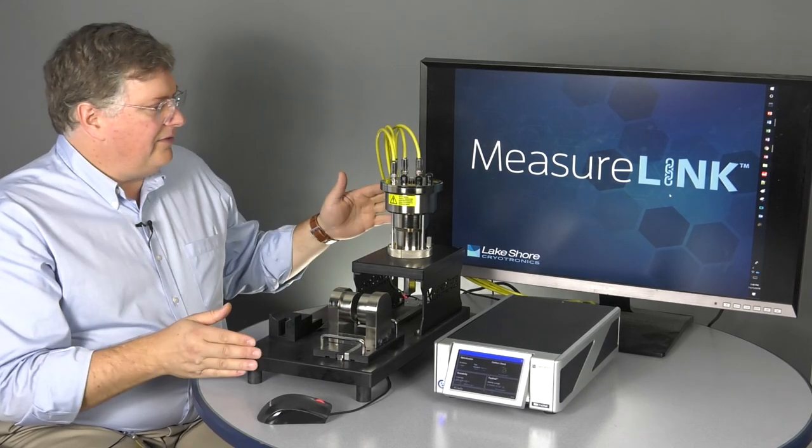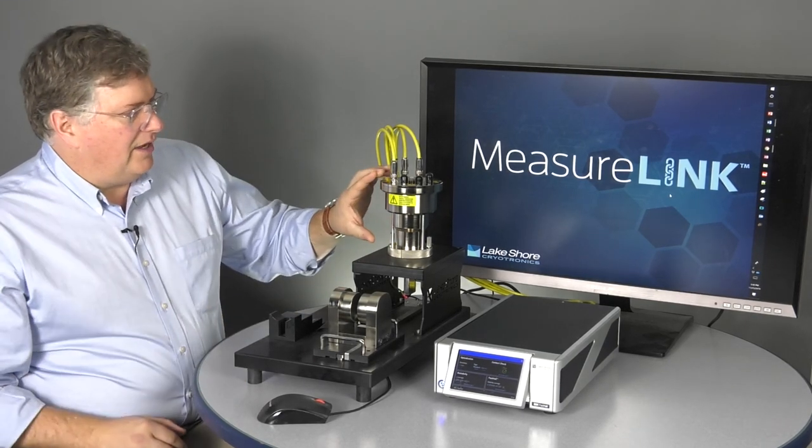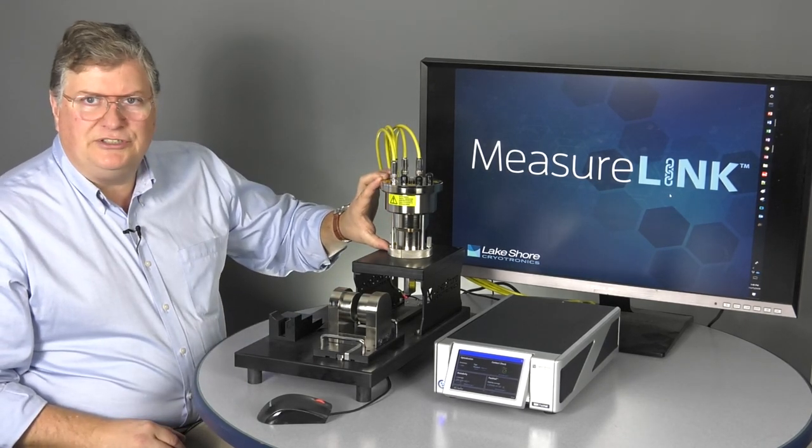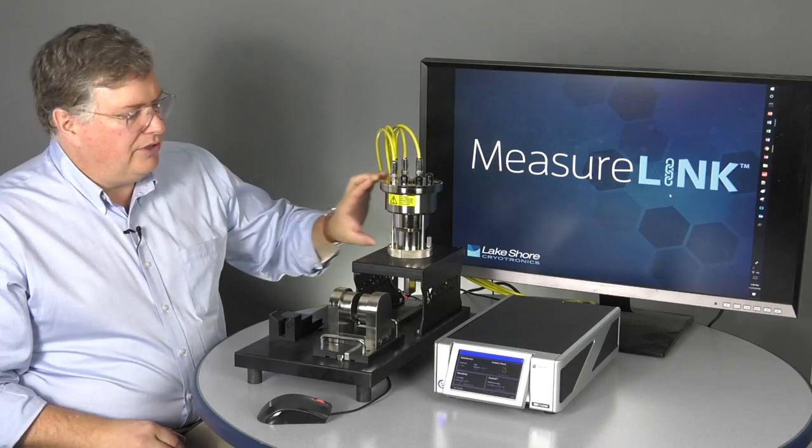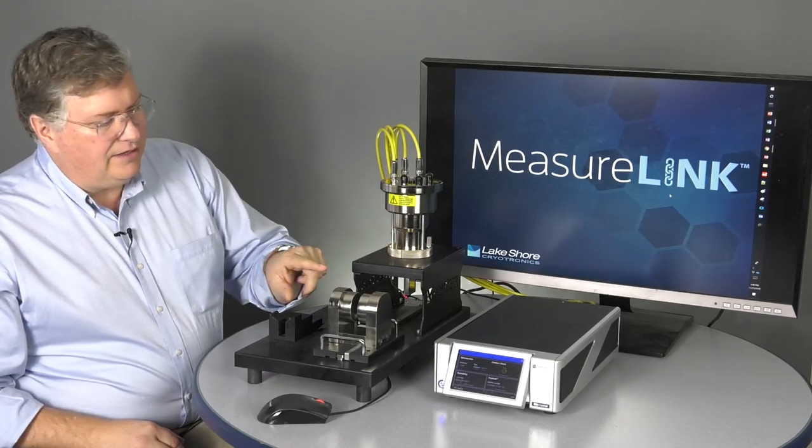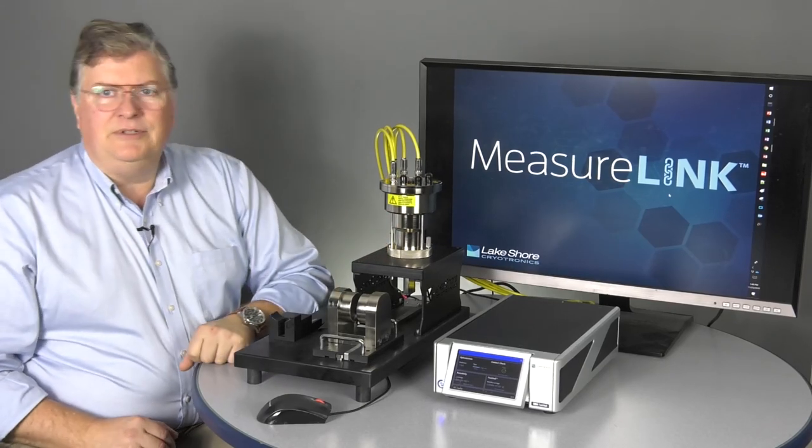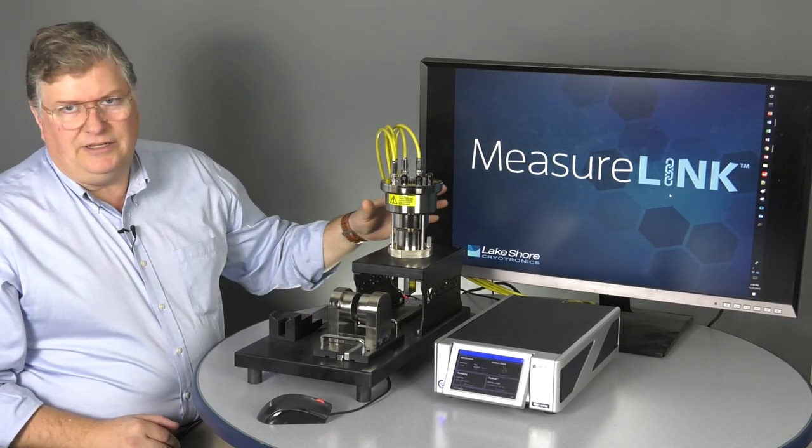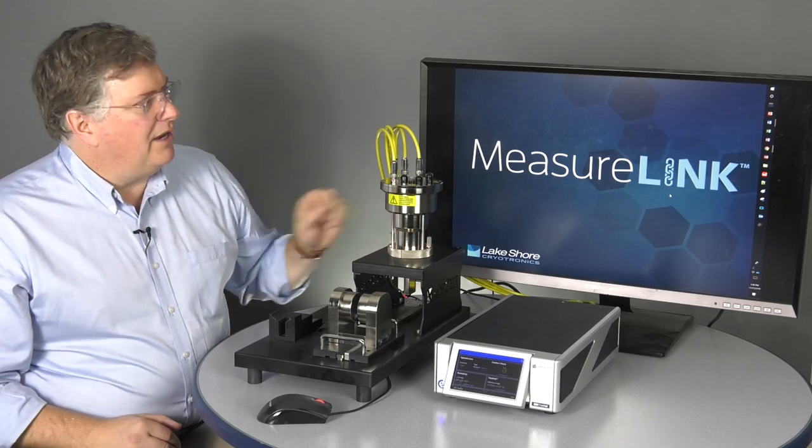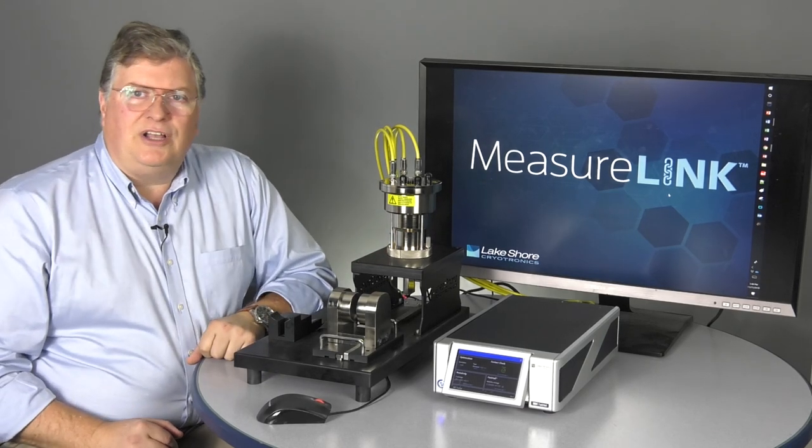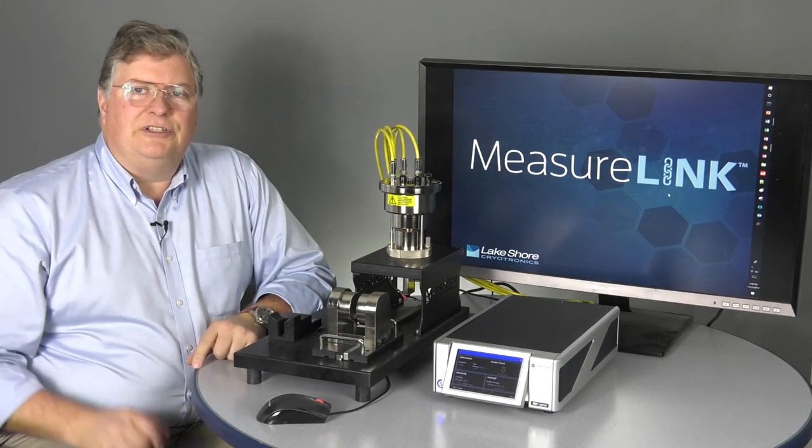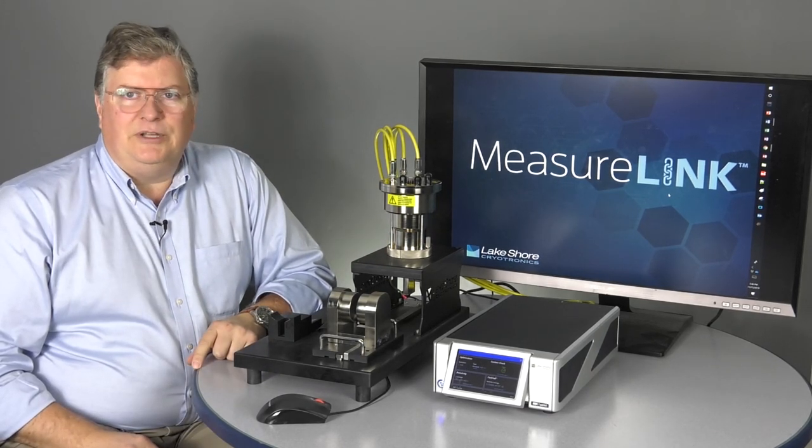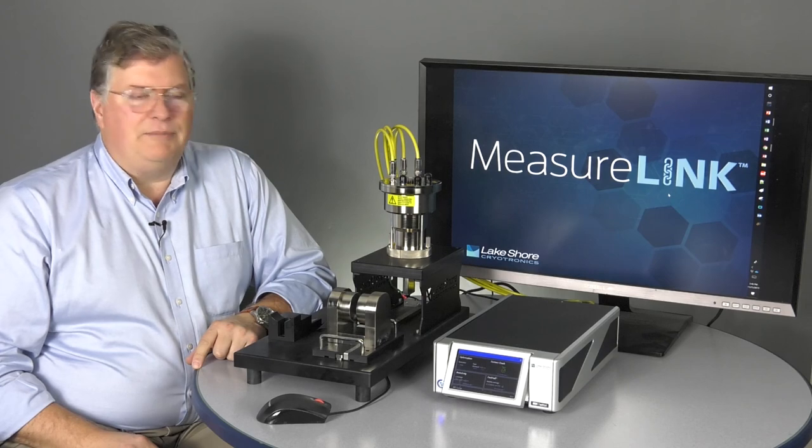We've combined that with a sample holder, a very high-precision sample holder, and magnet system. And then all of that is being governed by the MeasureLink software, which is helping us provide a very simple and easy way to make measurements.